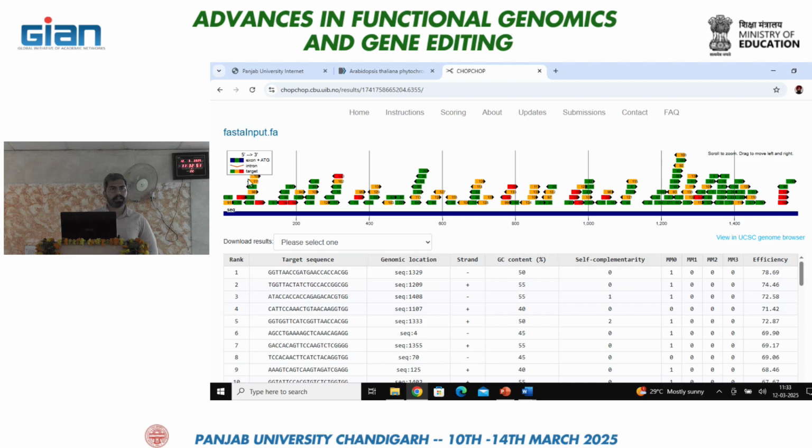Everything is red. You have taken the CDS sequence. Okay. I don't think there should be any problem because it should be CDS, and here they represent introns and these things, as mentioned in the top left corner.